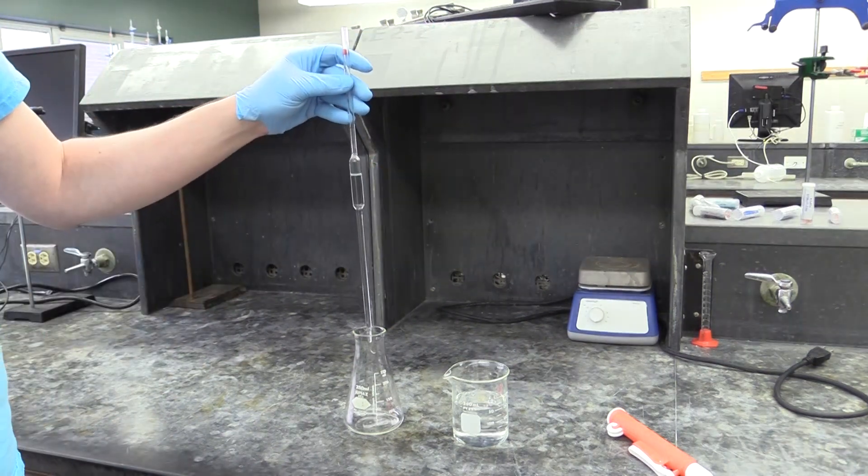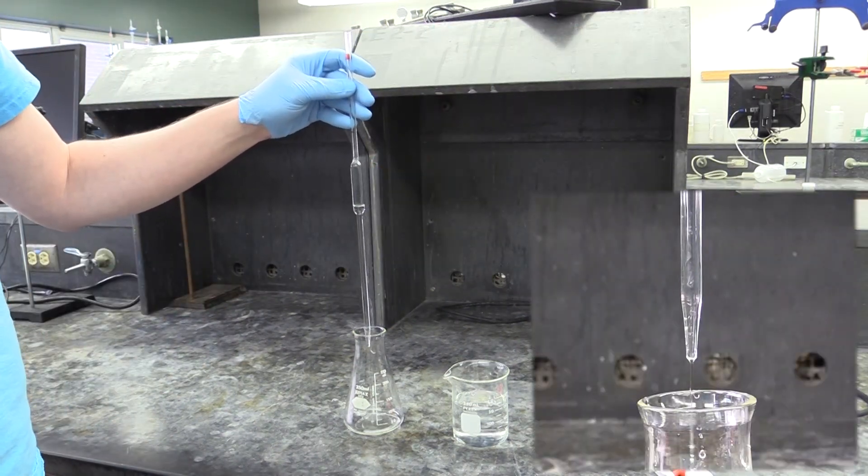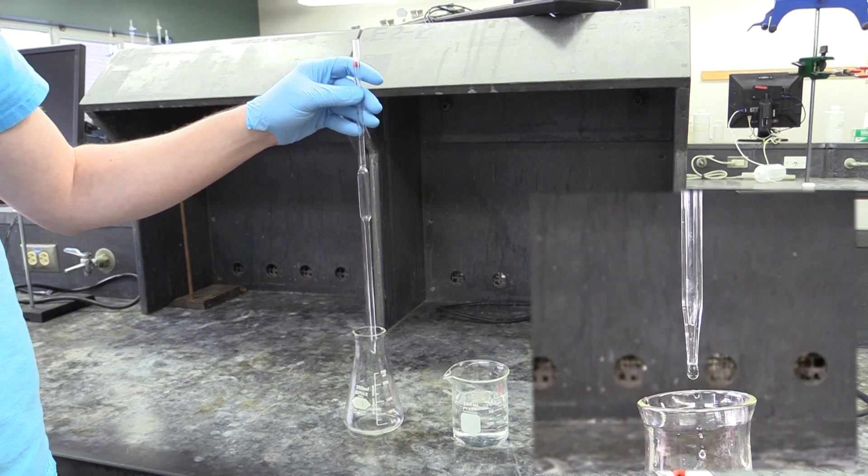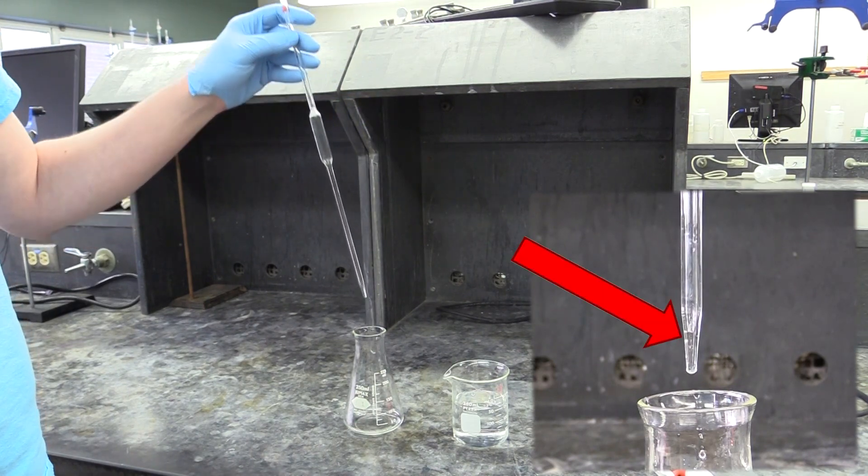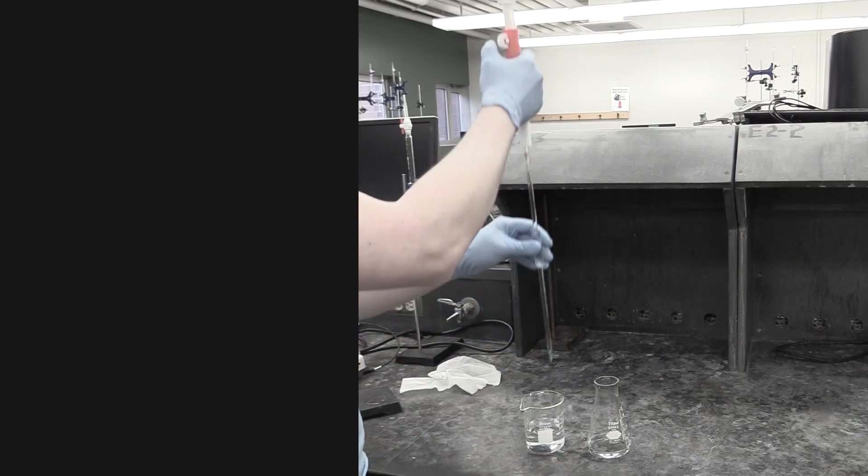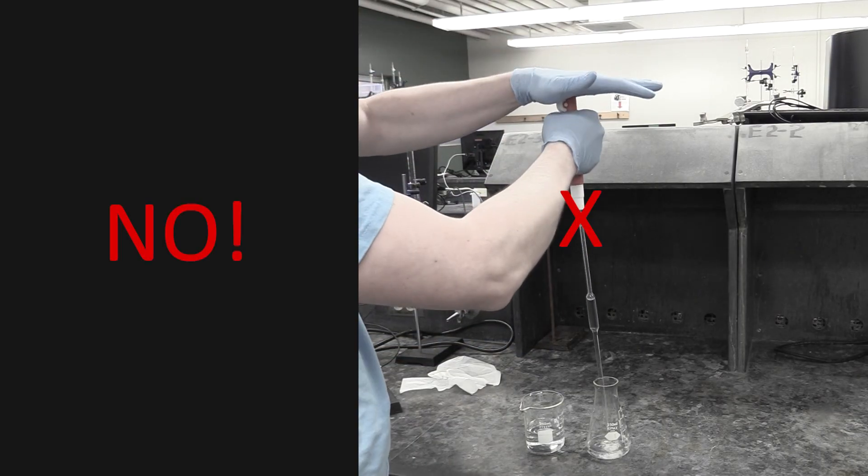When you go to dispense the liquid into your flasks, just let it gravity drain. A little bit of the liquid will stay behind in the tip. This is normal, and the pipette is calibrated for it. It's also the reason why you don't want to blow the pipette out with your pump.